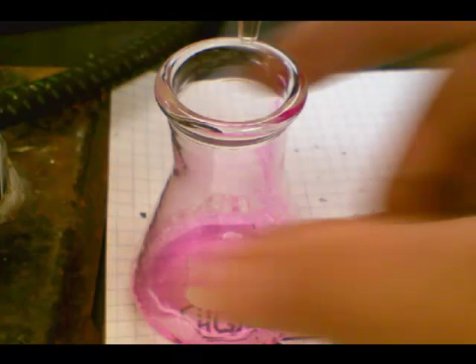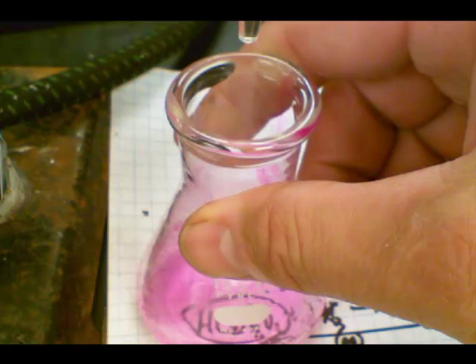I'll drain a little in there. I'm not exactly sure where the endpoint's going to be at this point, and swirl it around, and it's still pink. So I'll put a little bit more in there, stop draining it, swirl it around.